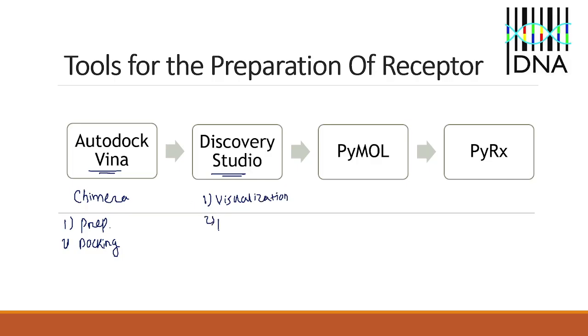Apart from that, it is also used for the preparation of the receptor molecule. Then for the preparation of the receptor, we have another tool that is called PyMOL. And this PyRx is for the preparation as well. But apart from that, it is the main and the only freeware version where we can perform multi-ligand molecule docking.